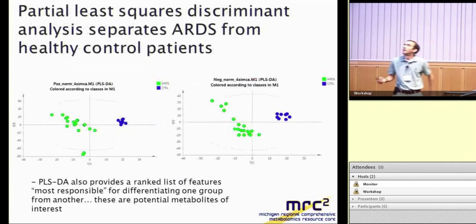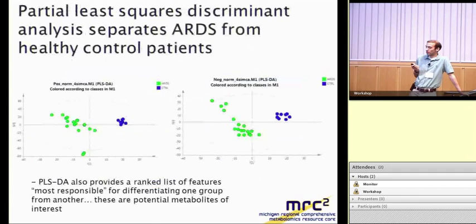What's that? So I'm sorry, yes. So we did, at this point, separate between positive ion mode and negative ion mode, as I mentioned. So they're two separate data sets. They ultimately wound up getting integrated together. They're all representative features. Some metabolites will show up in, so as I mentioned, we did a multi-platform approach here. A standard unbiased metabolomics experiment will always contain both positive and negative ion mode studies. So you'll get two data sets.